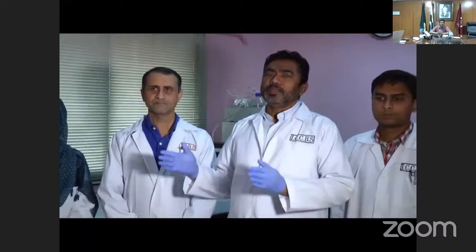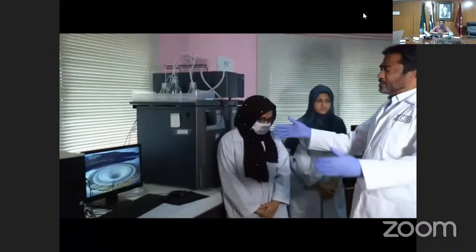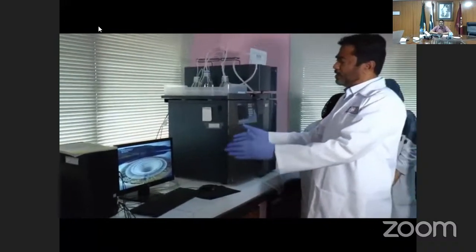One by one, we are explaining the parts. Yes, my other co-worker, Dr. Sabha, will explain how to make the methods, but now we are starting the HPLC with the parts which we mentioned yesterday in our presentation. If you can see, this is the integrator or computer.